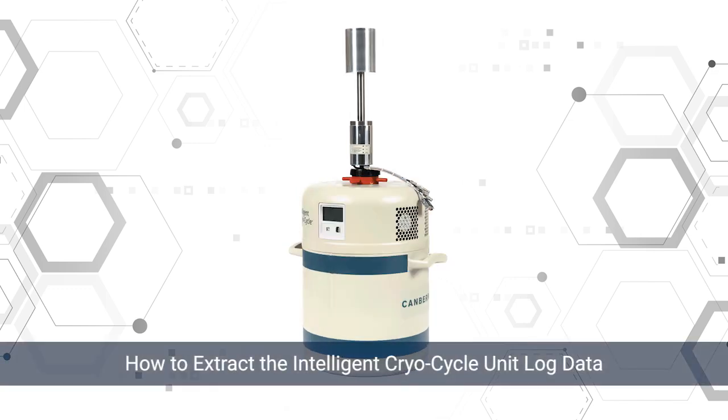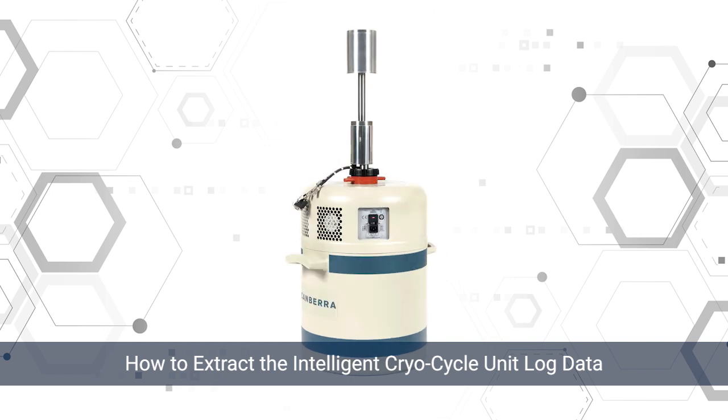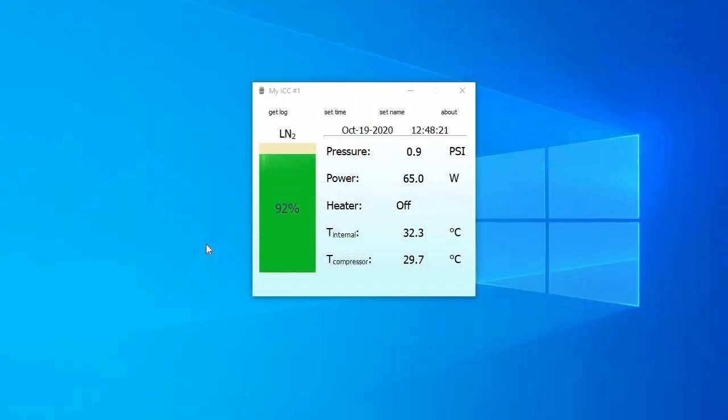In this video, we will show you how the state of health can be closely monitored via the Intelligent Cryo-Cycle display application, and how to access and extract historical log data.